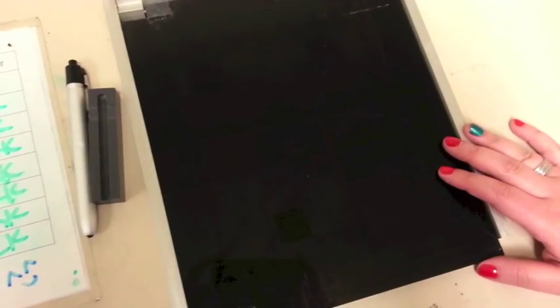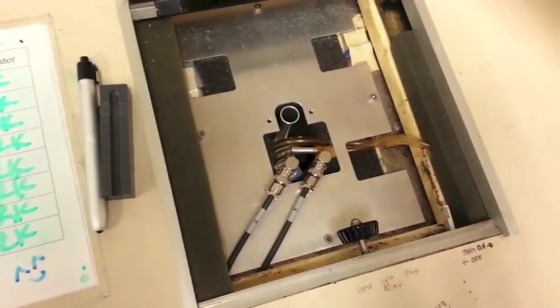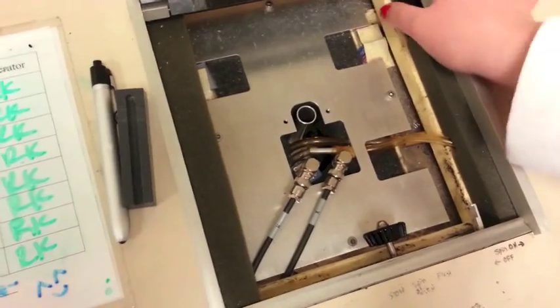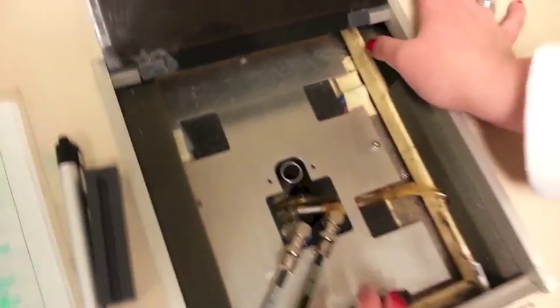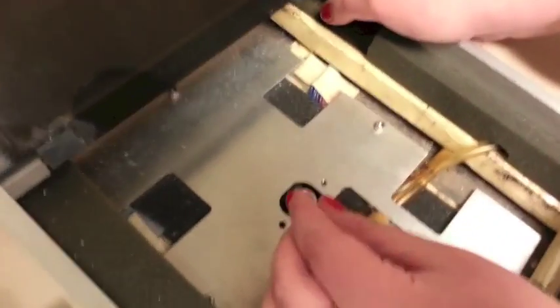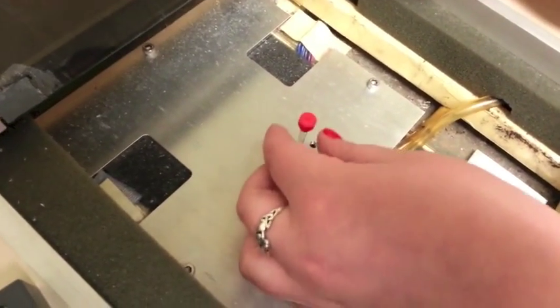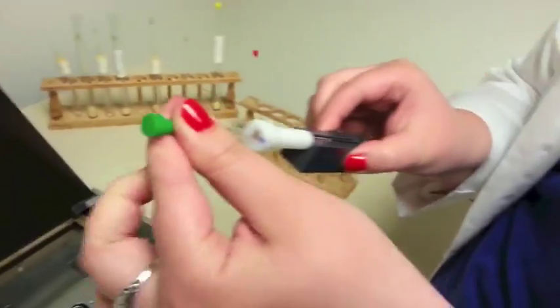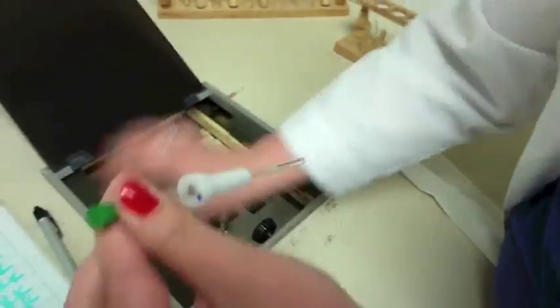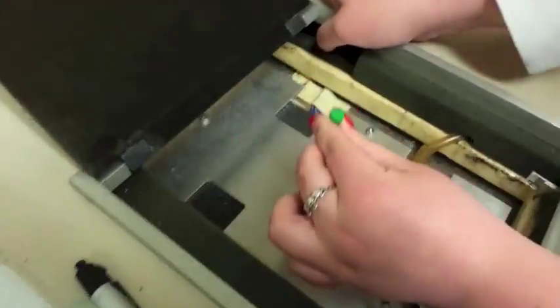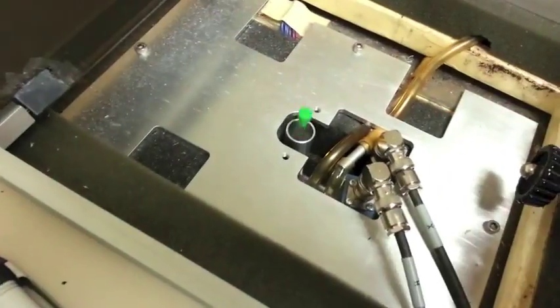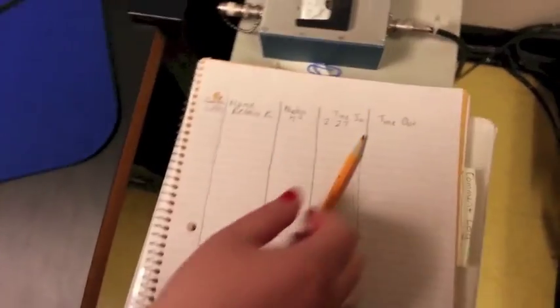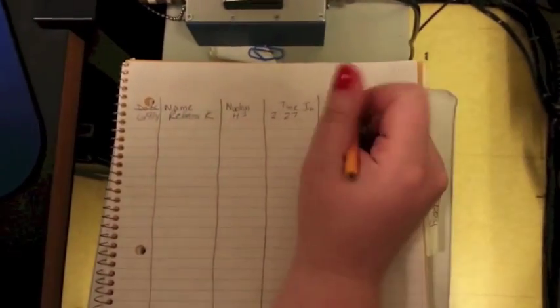Once you're done taking your NMR spectra, come back over to the machine, press the eject button to eject your sample. Again, take the bobbin off with a Kim wipe. Then replace the water sample. You want to come over to the sign in book and write the time that you were done.